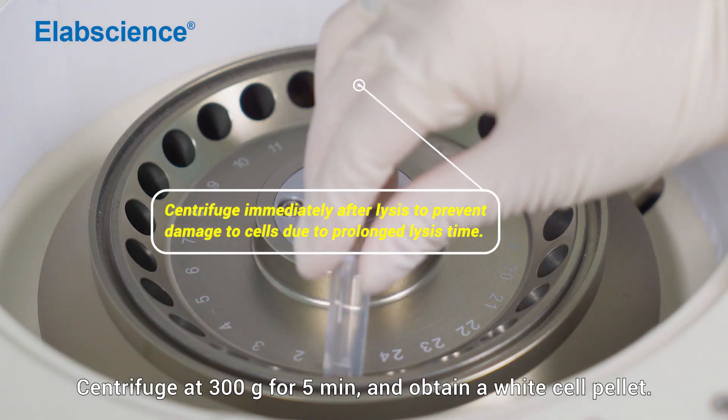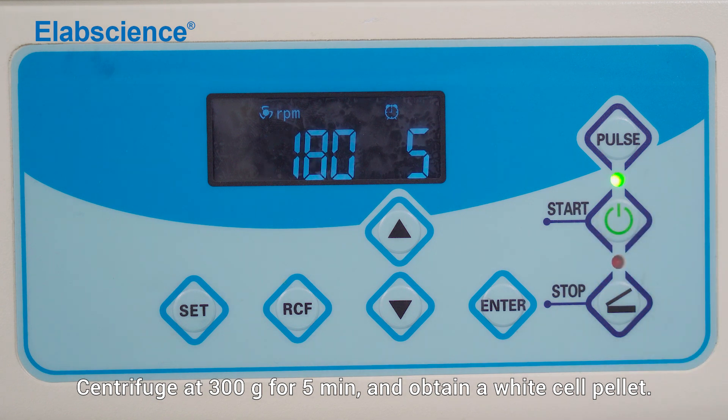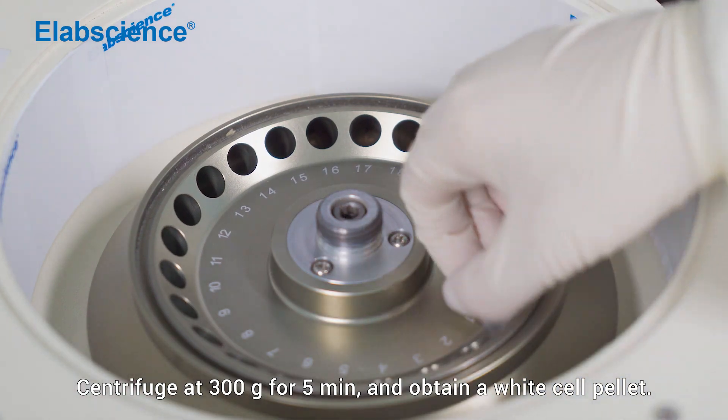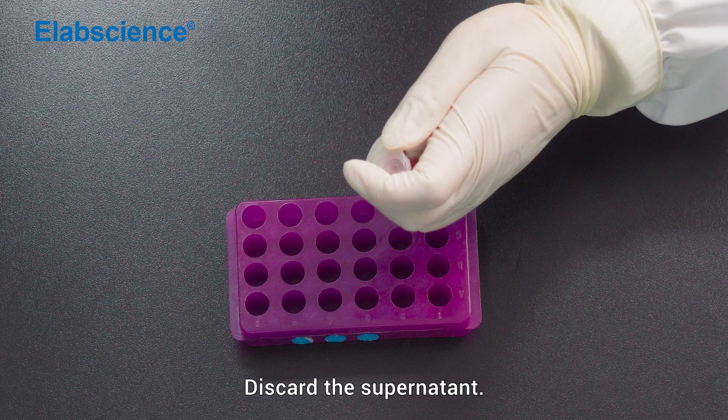Centrifuge at 300 times gravity for 5 minutes and obtain a white cell pellet. Discard the supernatant.